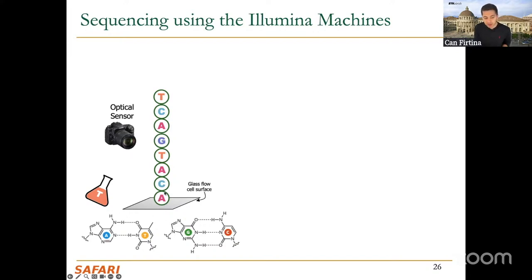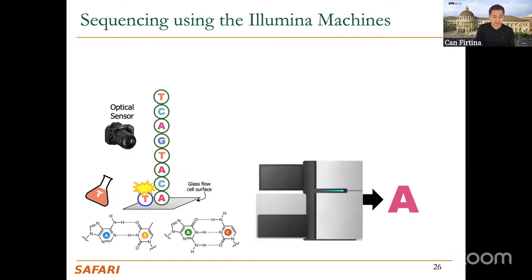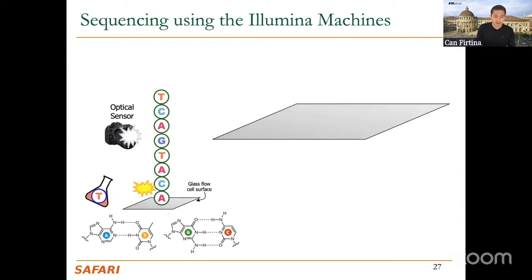And we don't have to know we have an A here, because we know that a T was just connected to this region. So having this information, we can then assume that there's an A in the corresponding part, right? So this is basically how sequencing by synthesis works. It's literally we take a picture and then we say there's an A on the other side.